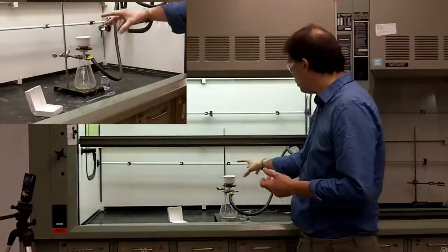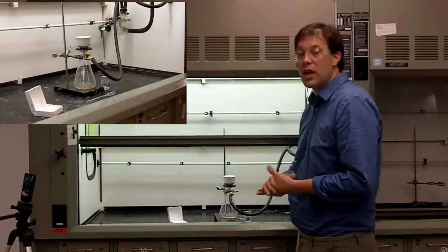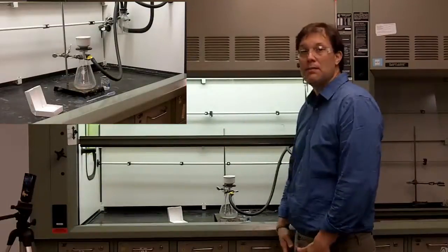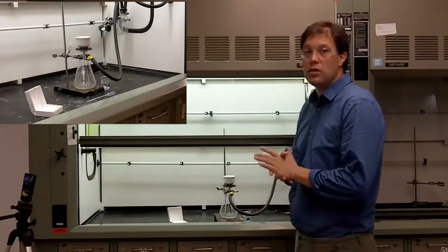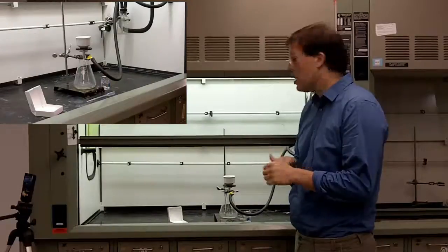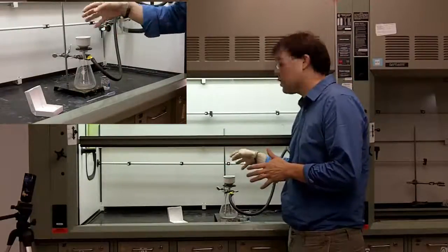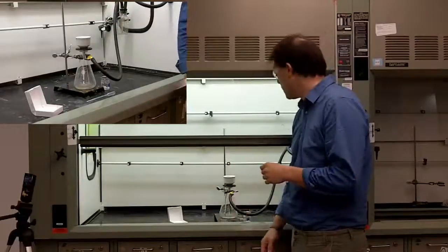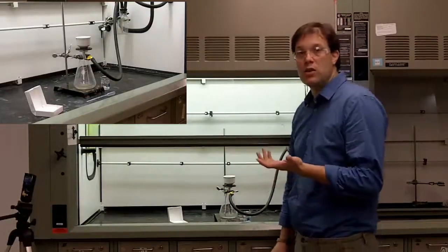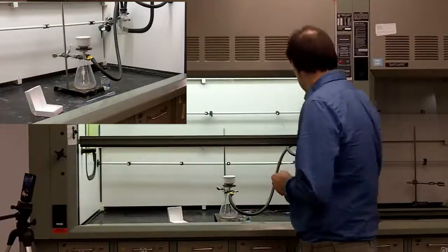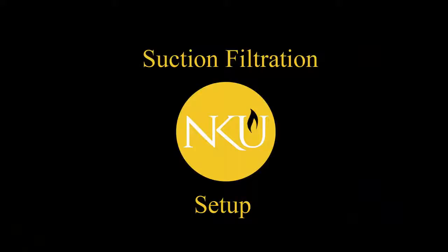Now, the final thing is, how long do you let it sit with air being pulled through it? That completely depends on the individual, the sample, and the individual setup. So, you just have to kind of keep an eye on it until you think it's dry. This one dried very quickly, because they're very large particles I threw in there, but sometimes you may have to wait two to three minutes for it to actually dry.